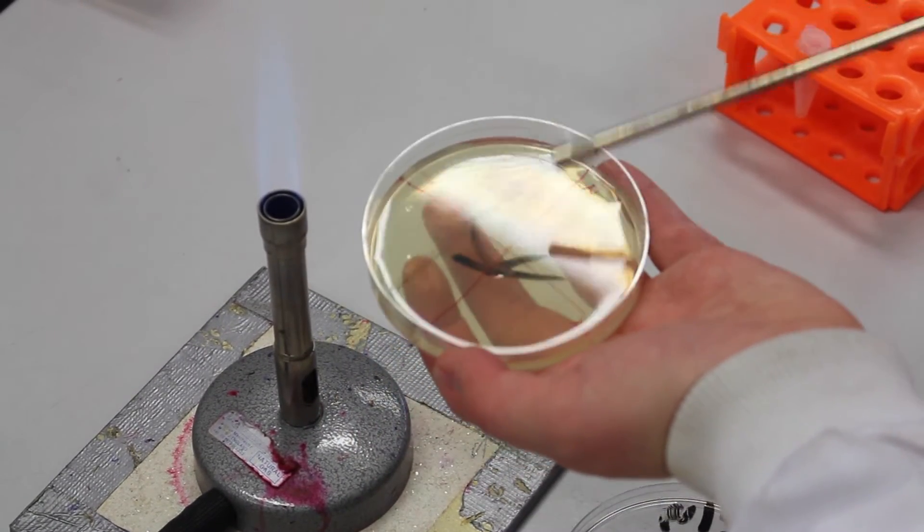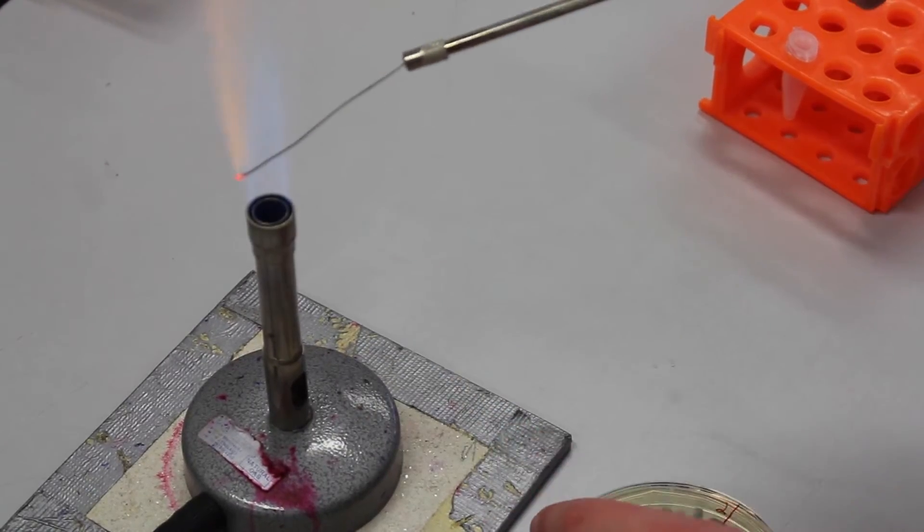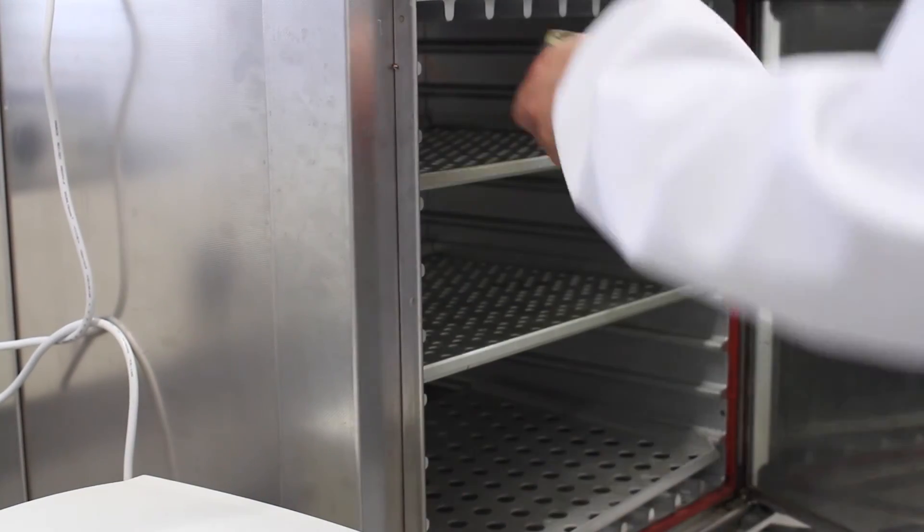Draw to and fro in one quadrant on the plate. Repeat the process for all the quadrants. Incubate plates overnight at 37 degrees Celsius.